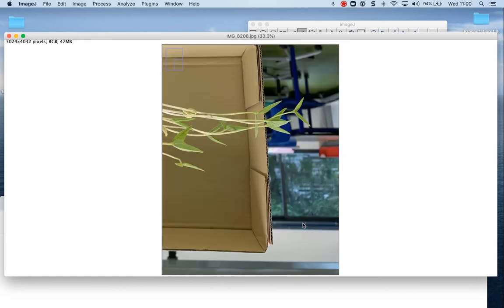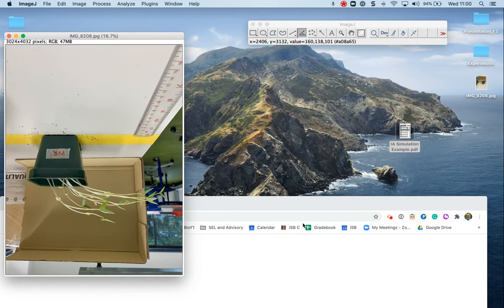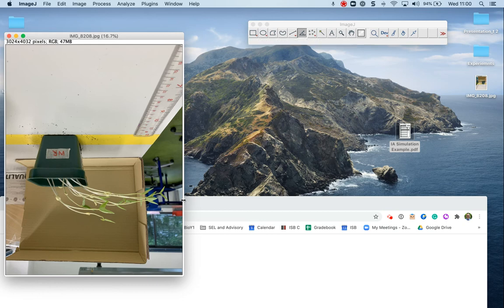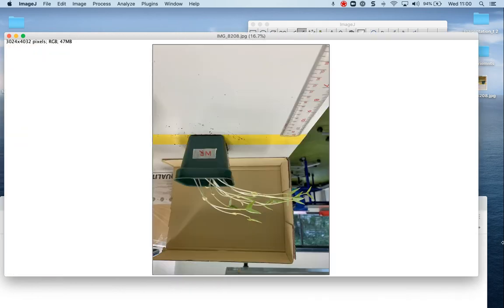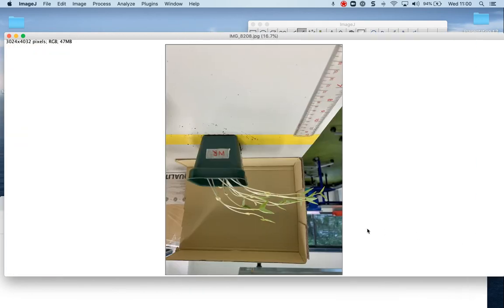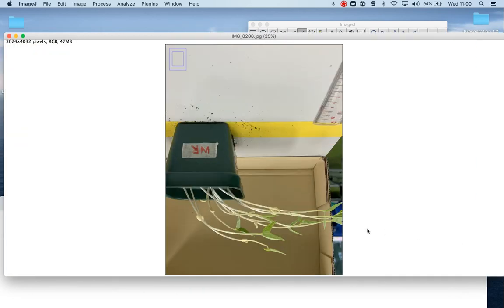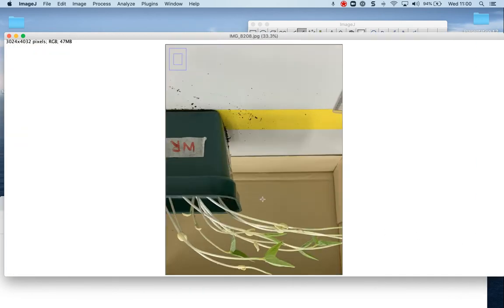Of course, one of the questions here is how do you begin to analyze this in a way that will generate some data?